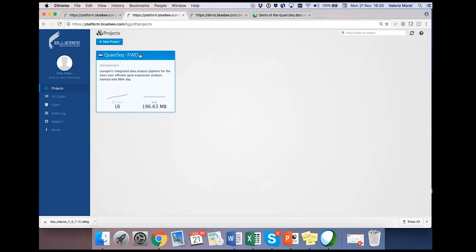Thank you, Michael. Jose is asking which are the default parameters of the pipeline, which genome and which annotation are used. I think you already answered this question, but there is an additional part of the question, if there is any reason to use a particular annotation. So we had different tests on the annotation. Usually the RefSeq annotation, which is also quite popular, the genes are usually too short there.